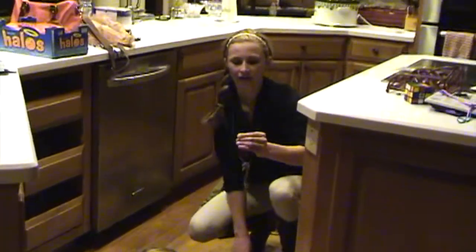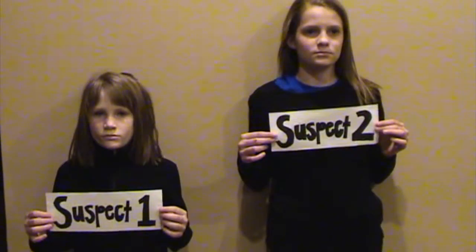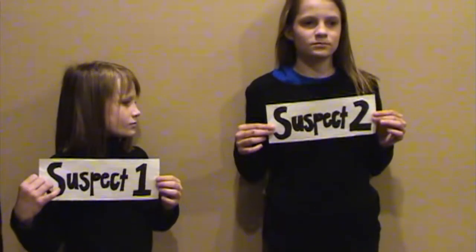I have found some hair that the victim must have grabbed from her attacker's head. I will use this along with a form of DNA fingerprinting to figure out who her attacker was. Here are the 2 suspects found fleeing from the crime scene earlier today. Suspect 1, Suspect 2.